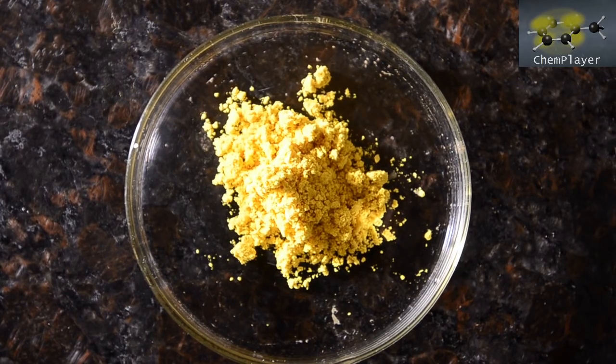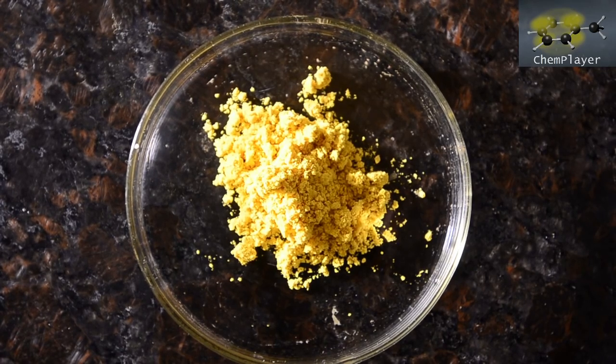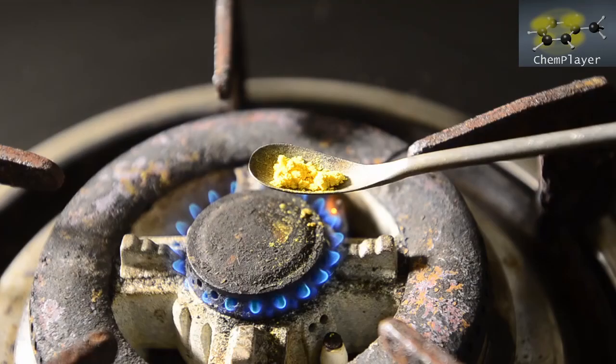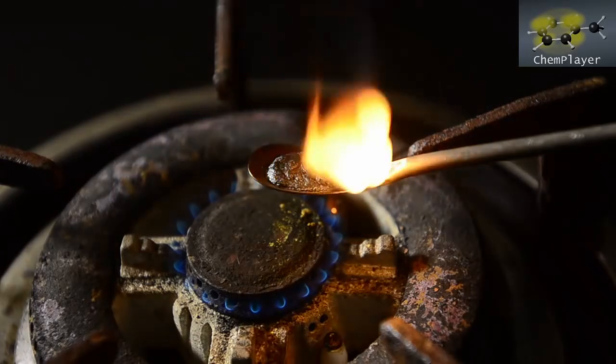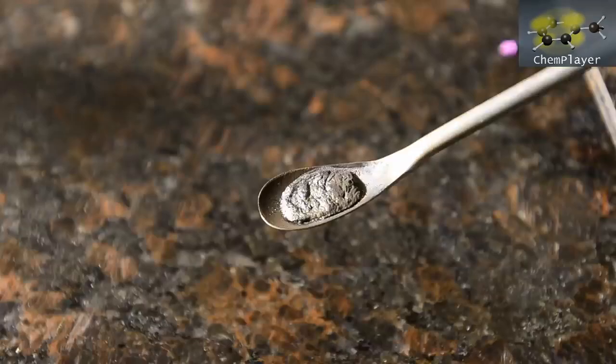So let's see if we can do a test to find out if it really is 5-nitrovanillin. First up, let's try to burn the sample. It melts at a fairly high temperature — much higher than vanillin — and then burns quite vigorously, leaving a spongy mass of carbon behind. Okay, well that's interesting. Now we know it's not going to explode, let's try something a bit more controlled.